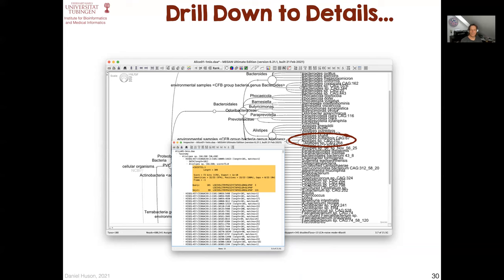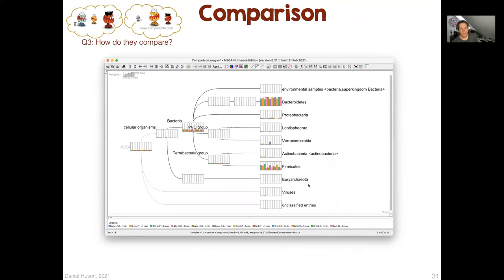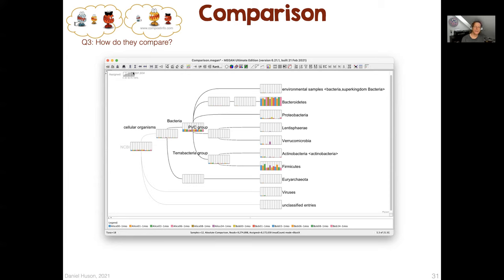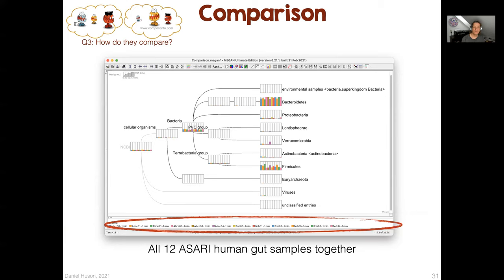MEGAN allows you to compare samples by opening multiple samples simultaneously in what's called a comparative document. You can see how different samples map to different taxa. For example, using mini bar charts on each node to represent the number of reads assigned. You can see the legend for different samples down here. Quite often you might not use linear scaling, but square root scaling, which makes it easier to find nodes where there are non-zero counts.